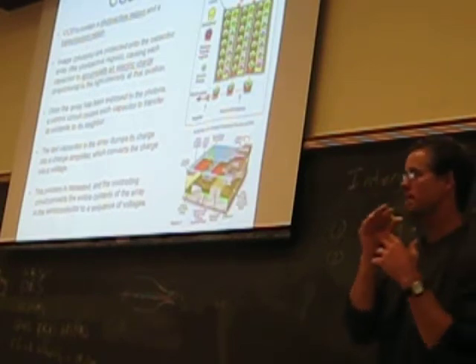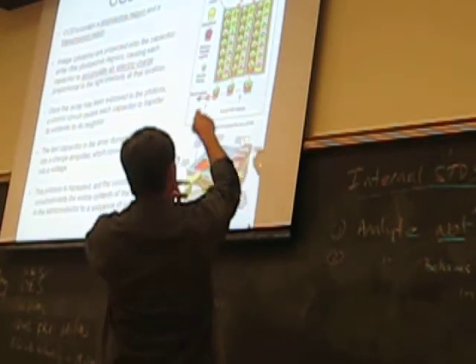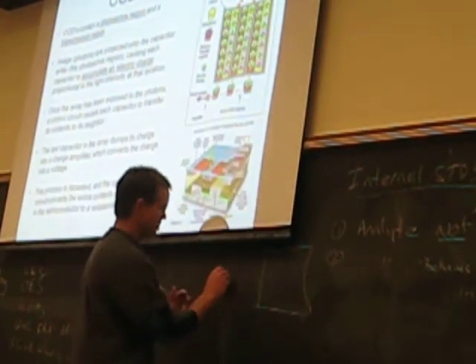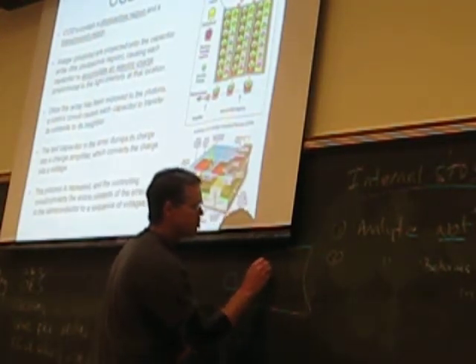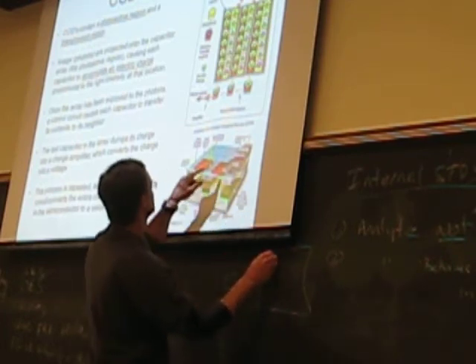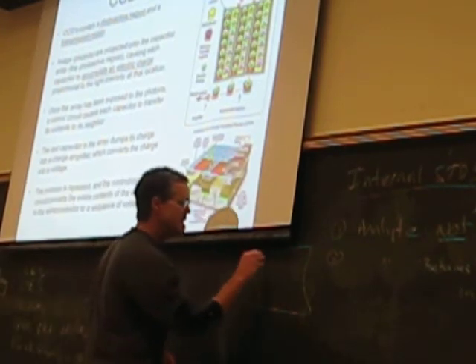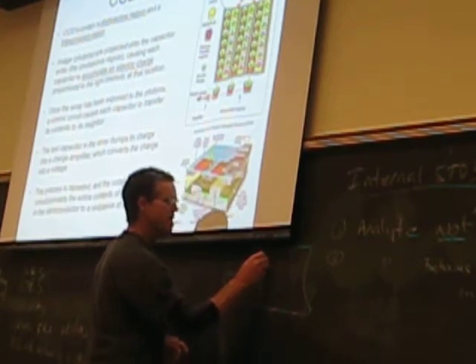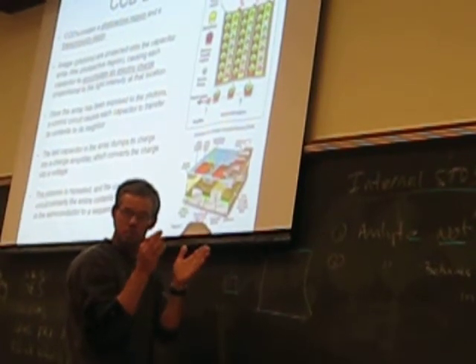Okay. And so you would have a surface, kind of like this, right? But it's a surface like this. In the instrument, it's probably about that big. But it's got all these divisions of pixels of this charge-coupled device, and each of these pixel areas is a configuration like this. And the photons come in and hit it, and they cause a release of electrons into an adjacent register, and they build up there until there's a sufficient buildup of charge, of separation of charge of electrons.